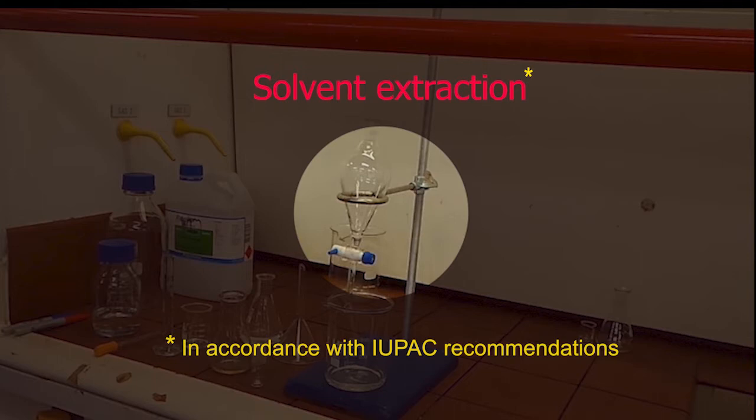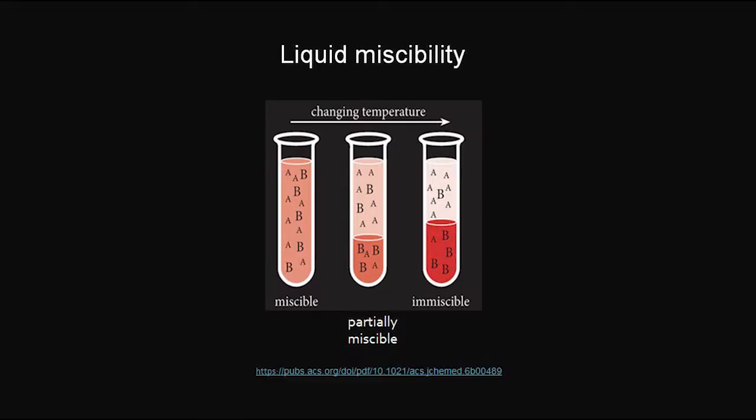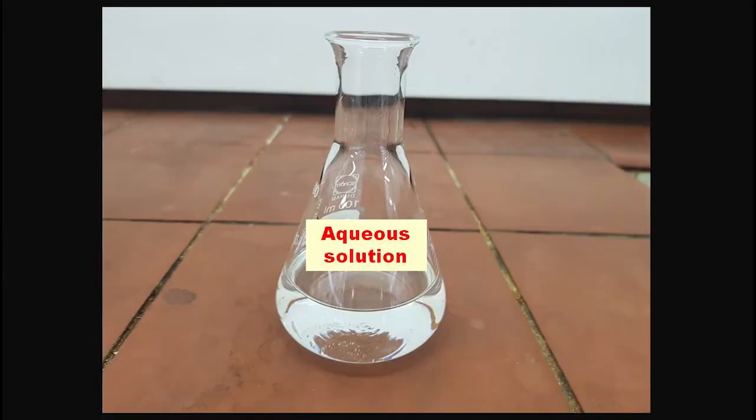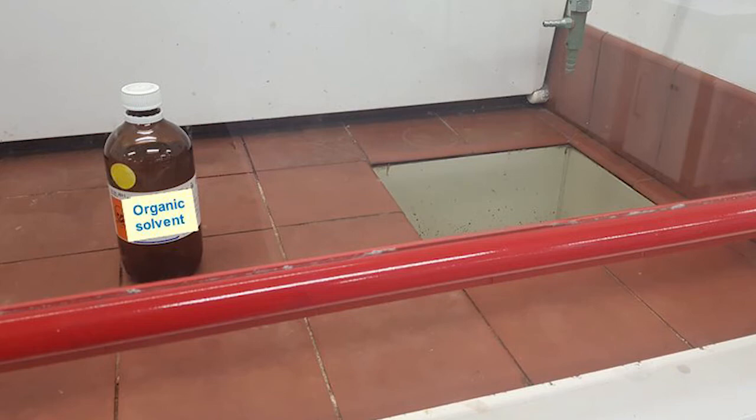It can be used to transfer an analyte from one liquid phase to another liquid phase in contact with it. It is based on the relative solubility of an analyte in two immiscible or partially immiscible liquids, one of which is usually an aqueous solution and the other is an organic solvent.